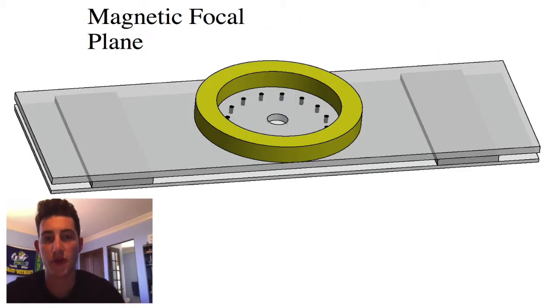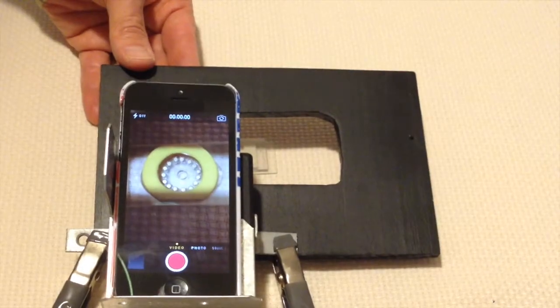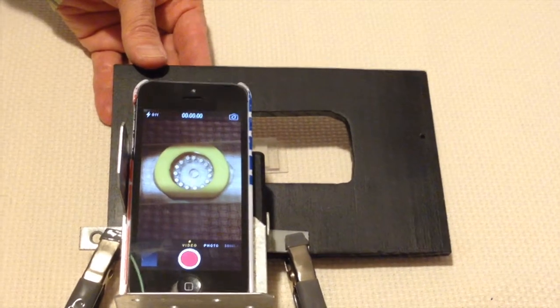Here is the final device without a cover slip or a hanging drop. We call this the magnetic focal plane. The cover slip with the hanging drop fits right over the yellow spacer. The size of the bacterial spot depends on how many bacteria are in your sample, but it's typically a fourth of a millimeter.